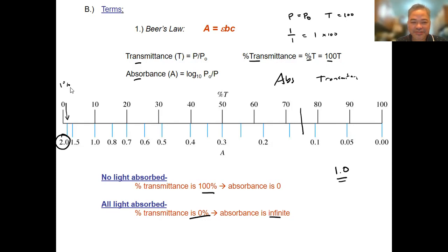If you're going to look at this, usually this one, right? Log. So if you have an absorbance equal to 3, that means only 0.1% is transmitted. So the amount of the light that is blocked is so high. We could say this range is outside the meaningful range of most of the spectrometers that we use. So what do we do?